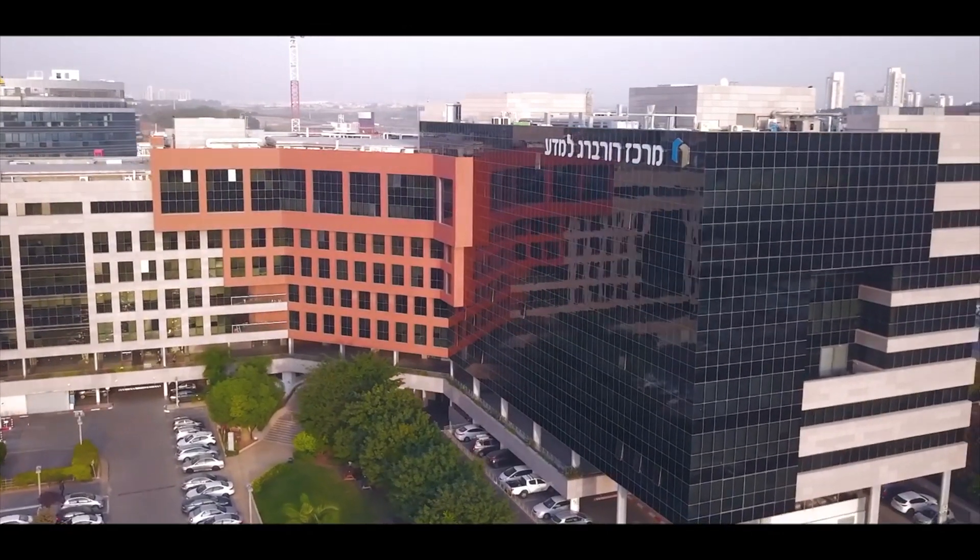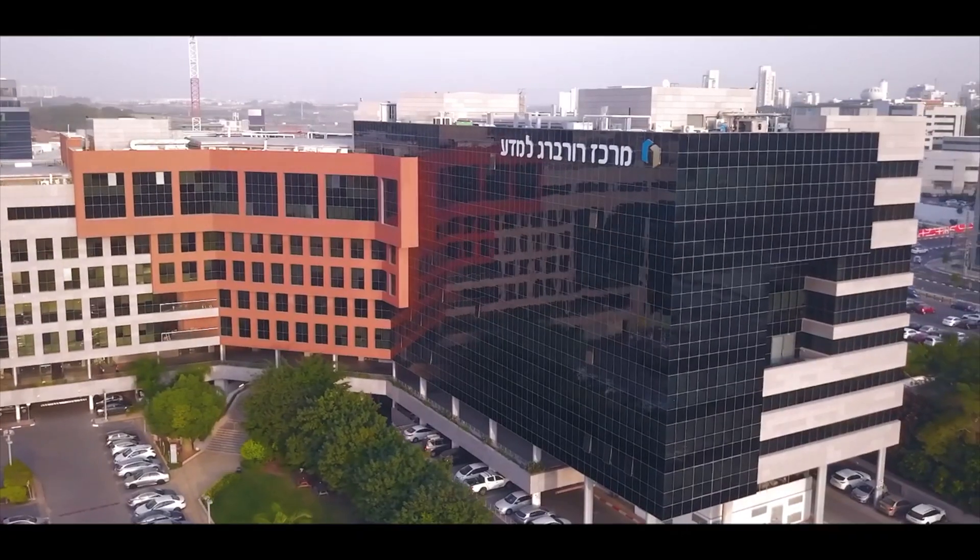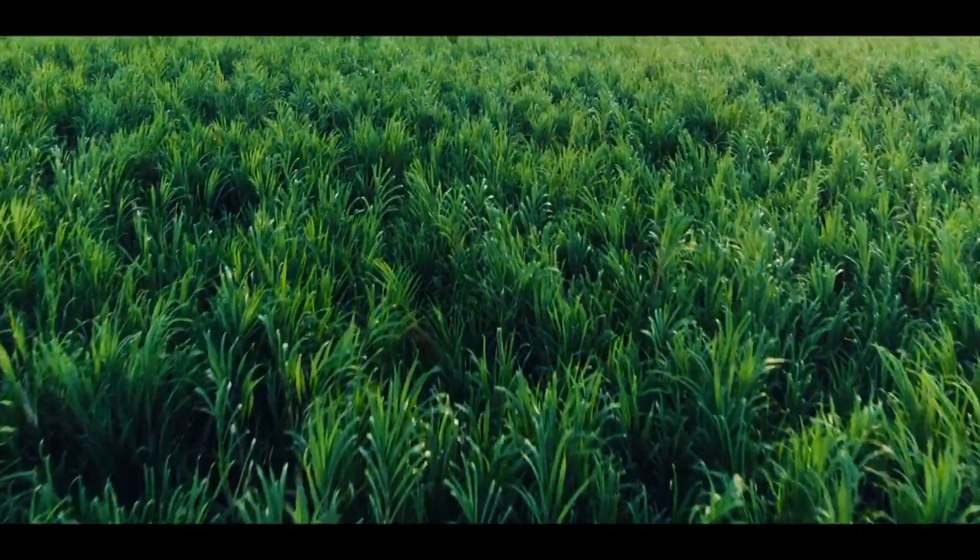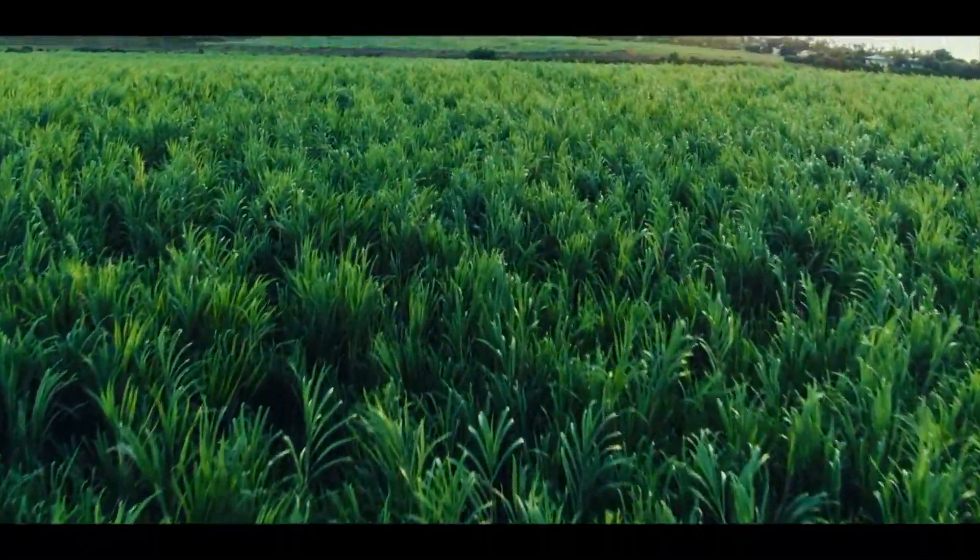Biofarming is the cell growth technology that produces directly the active ingredients of a plant without growing the plant itself. Here is how we do it.